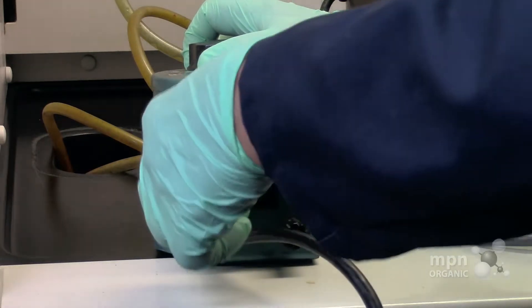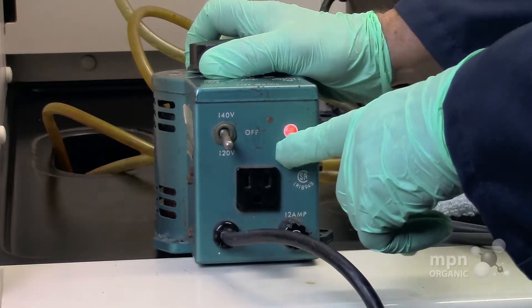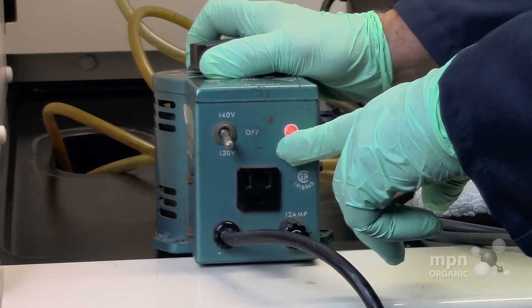You're going to set it at 120, because that's the voltage of the place where we plug it in. You can see that it's on by this red light here.